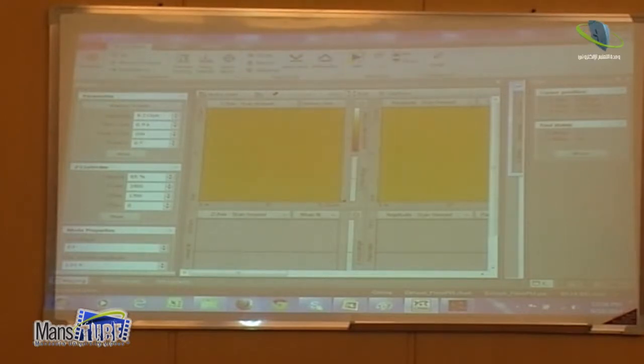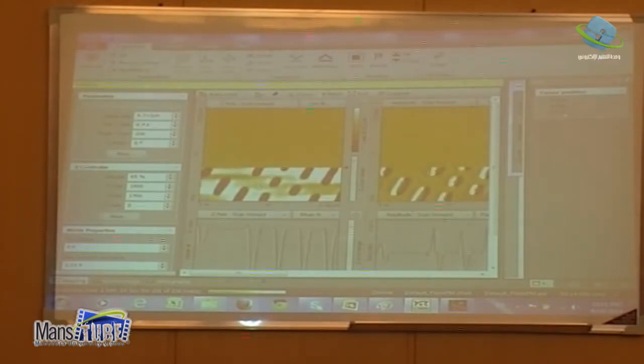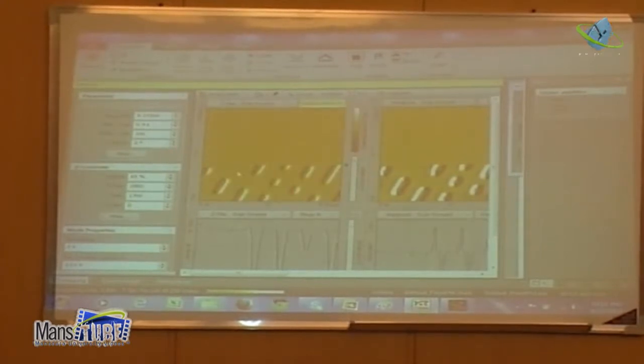Okay. And now I make start. Now I'm supposed to see the image somewhere here. So now we see this one here. You see this one here, and maybe now we should see it here. I mean, plastic is an easy material. And this is the logo. You see it now? The logo I can see.